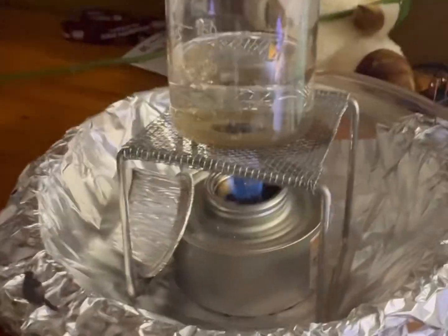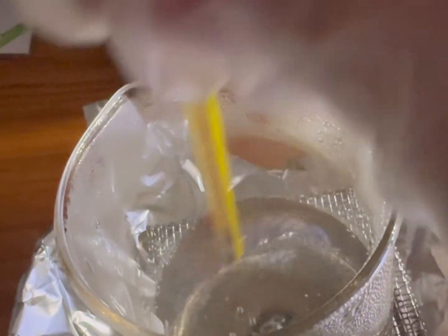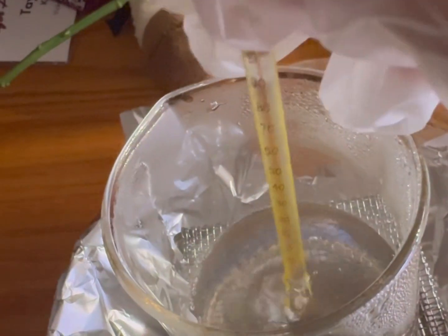The 1 teaspoon of salt water is now boiling, so we'll test the temperature using this thermometer, and it should be really high, the boiling point.